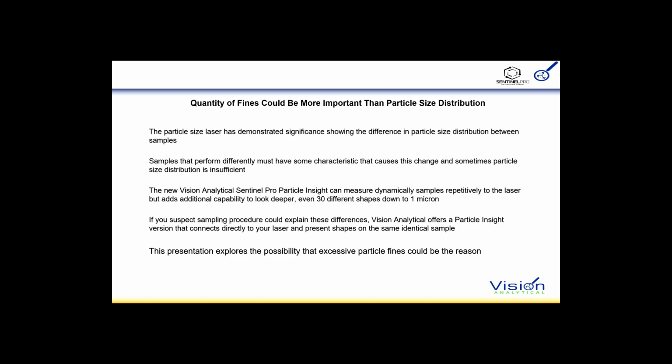Laser particle size distribution devices measure all particles as if they were spheres. It looks at the light scatter around the particle and calculates an equivalent circular area diameter sphere of the light that represents. So the more your particles are not spherical, the more the laser is measuring your size distribution too coarse. As the particles become less spherical, they're being reported as too large.